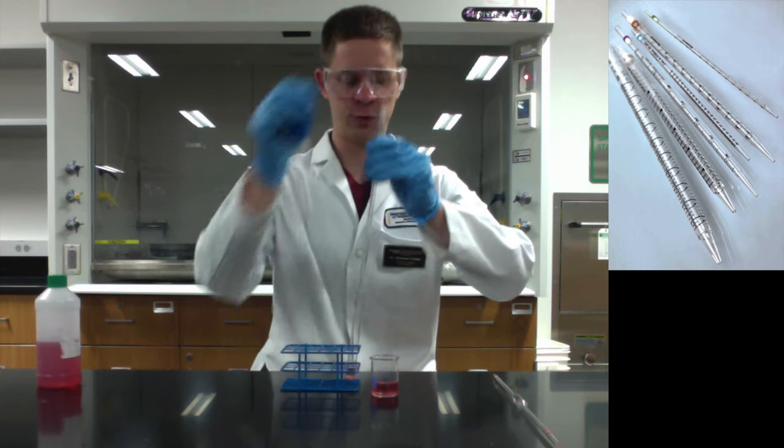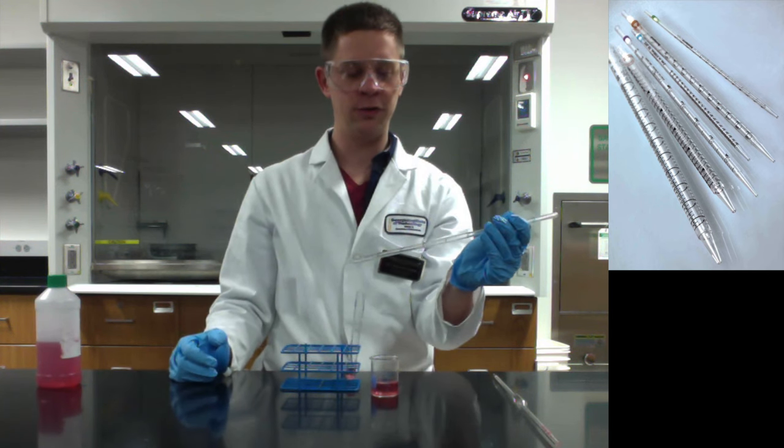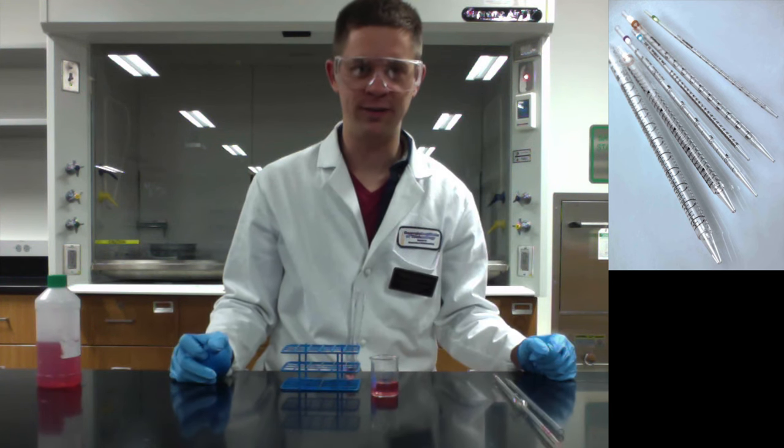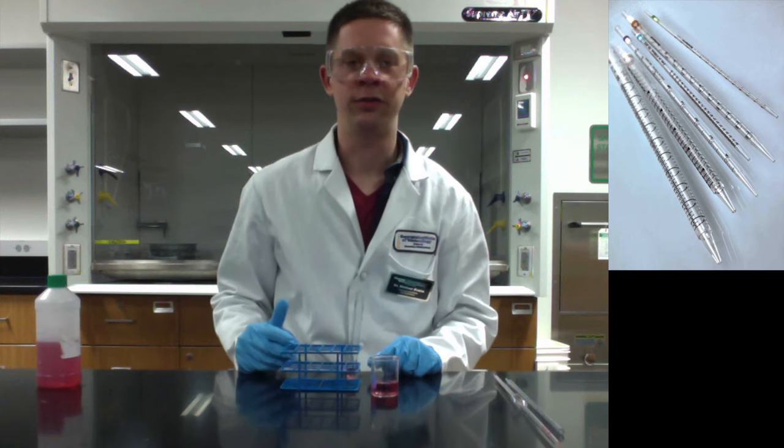Just use your pipette bulb to squirt out that last little bit of liquid so that the pipette itself is completely empty. And you've just delivered 2.6 milliliters of liquid with the serological pipette.